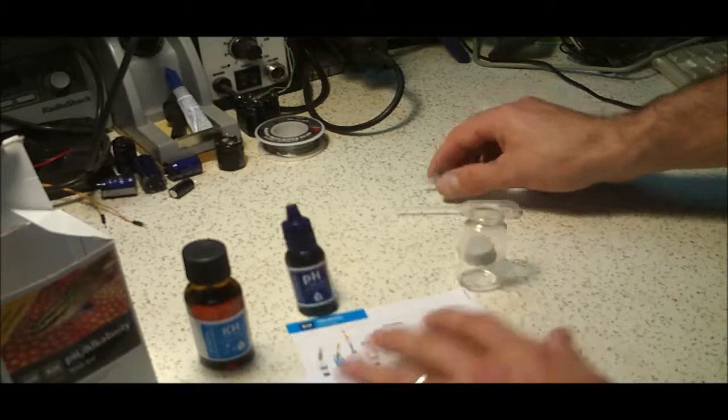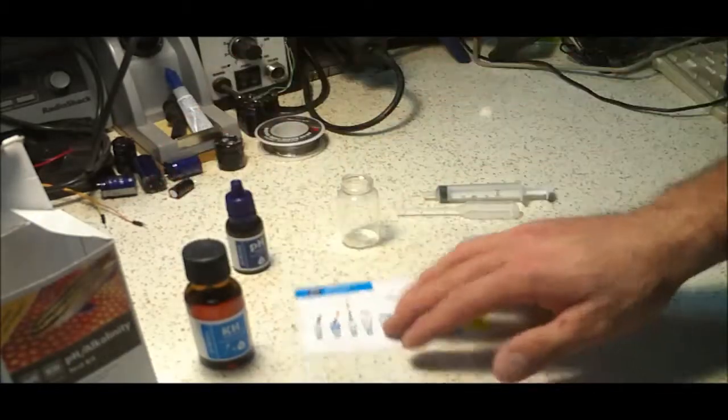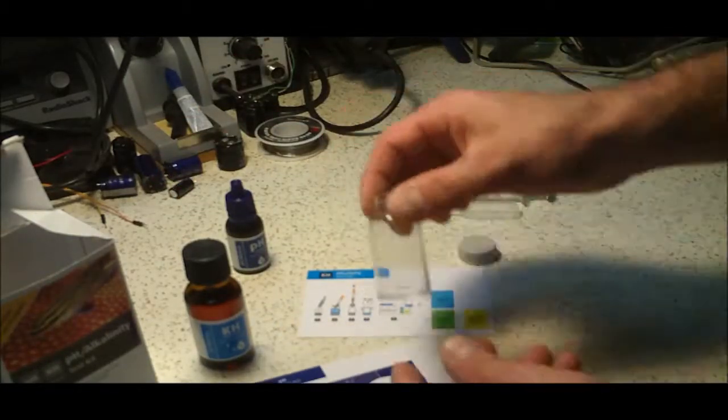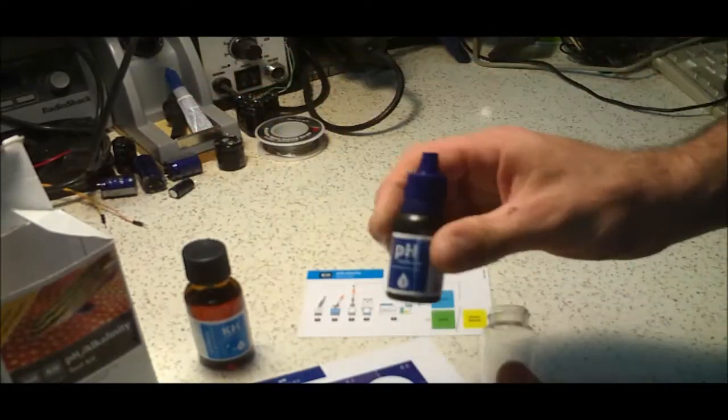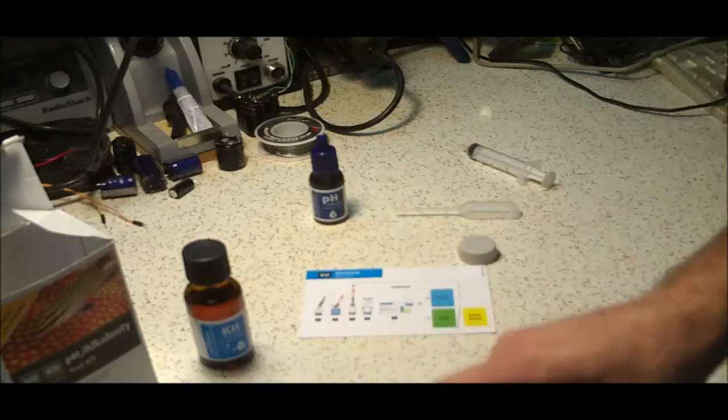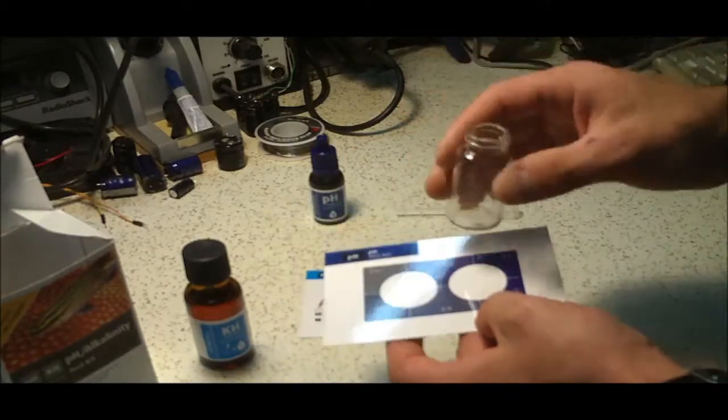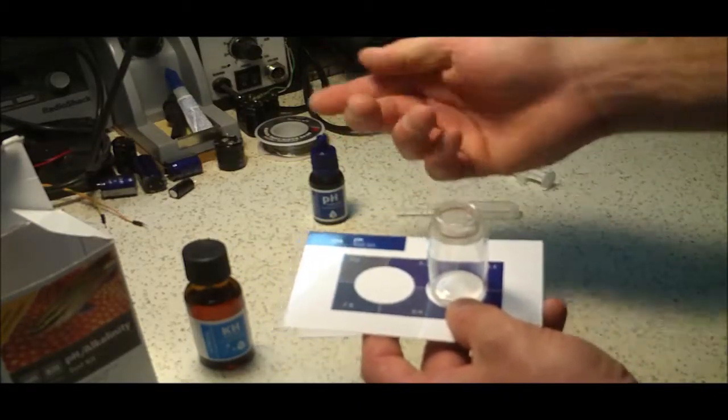So first the pH. The pH test you take 5 milliliters of water, which is what the syringe is for, you stick it in this vial. You add three drops of pH solution, shake for 10 seconds.